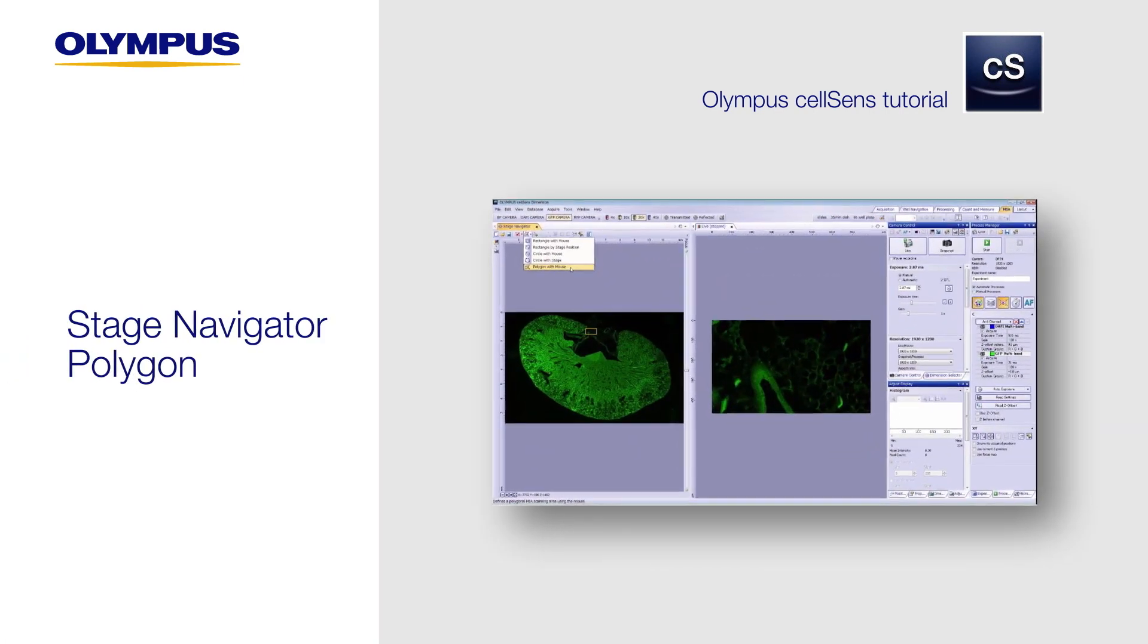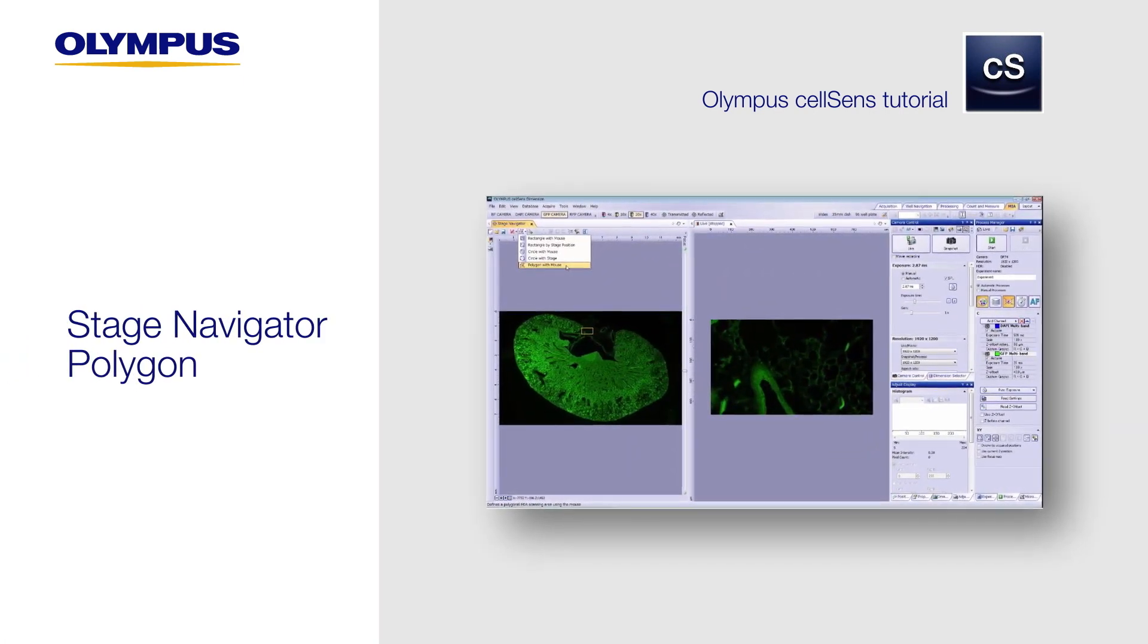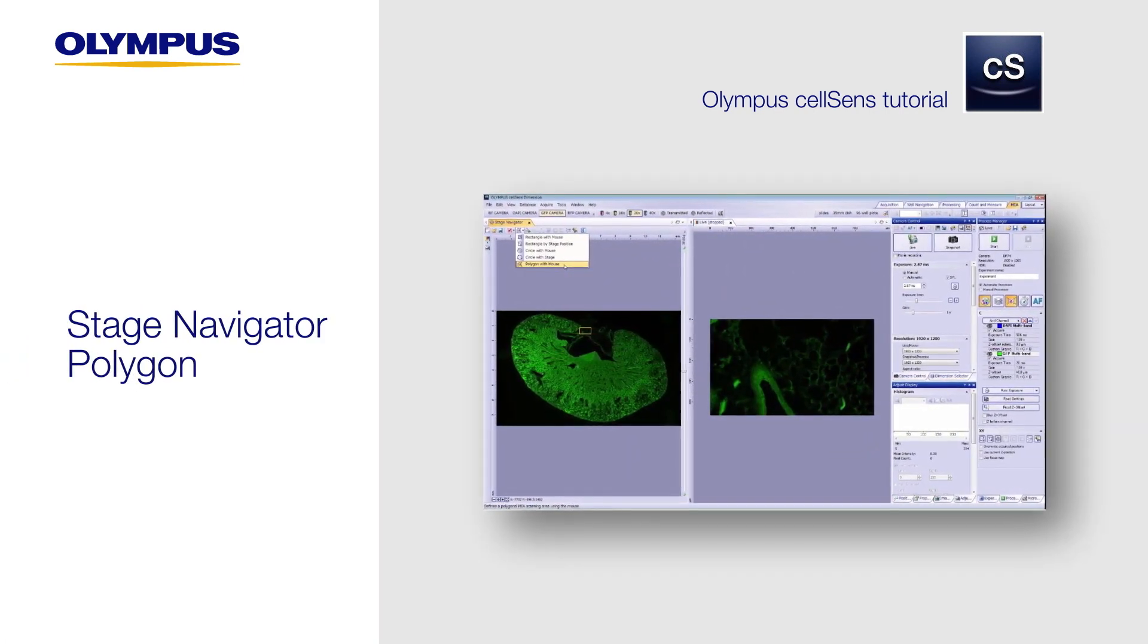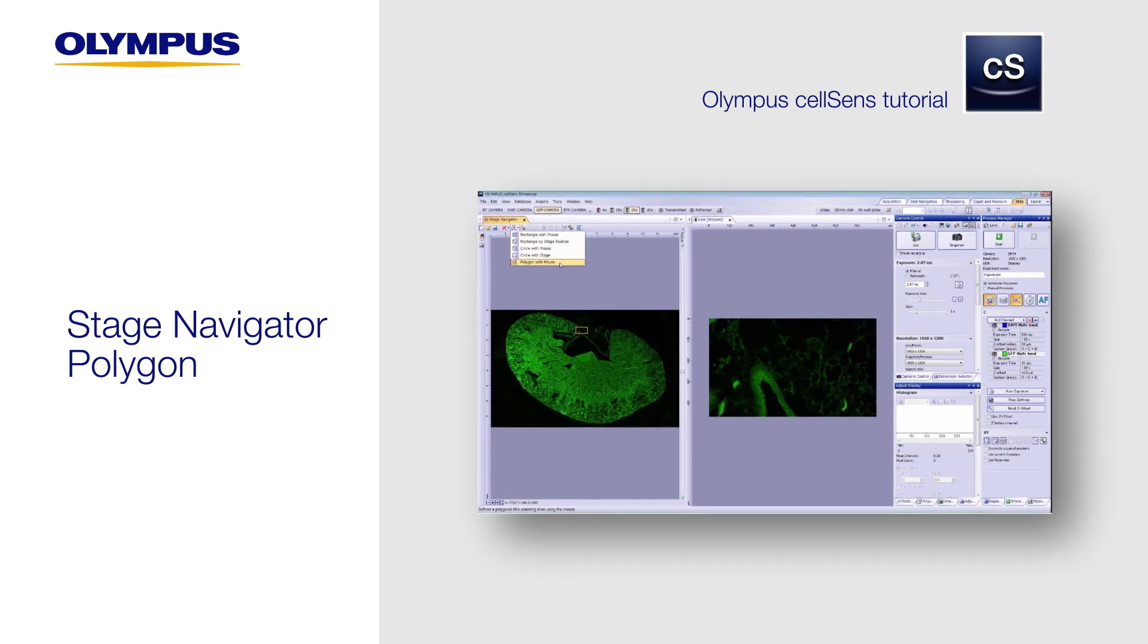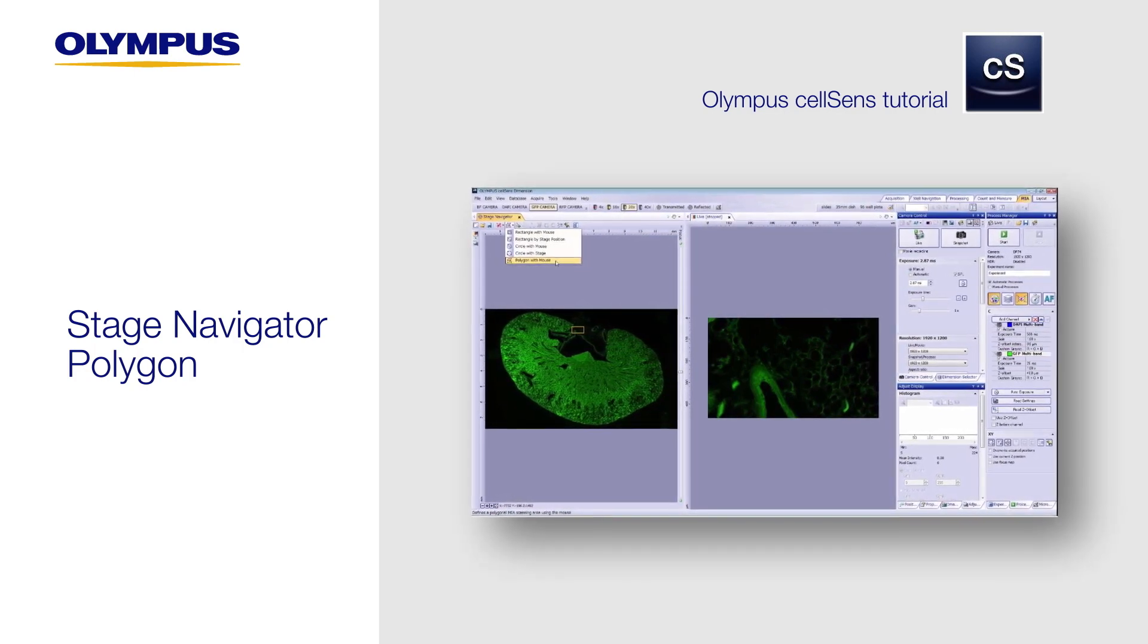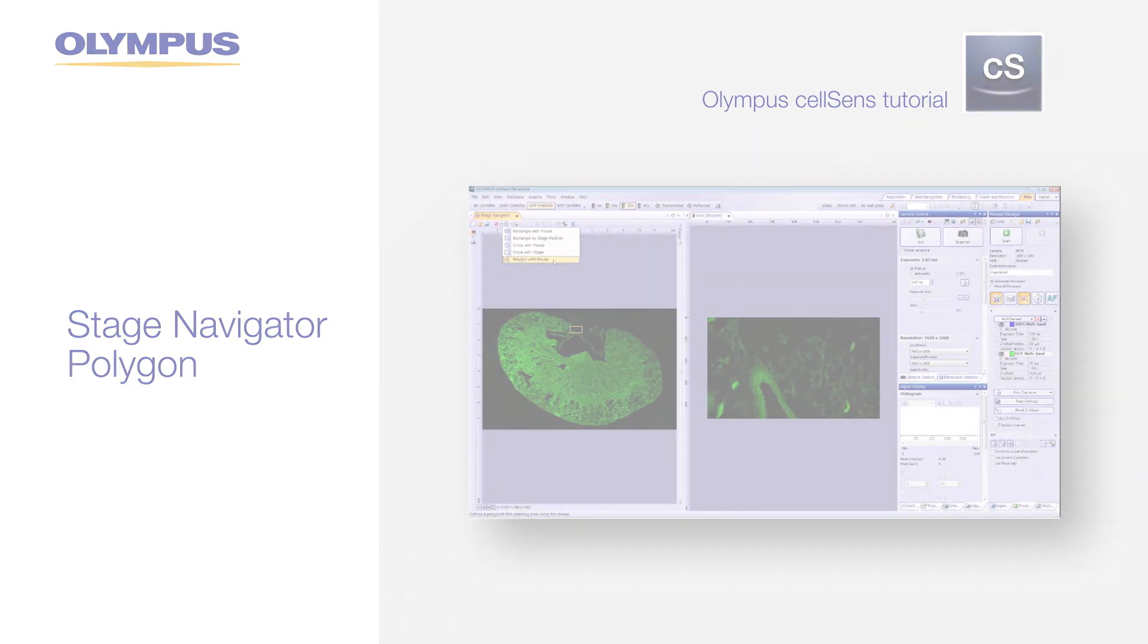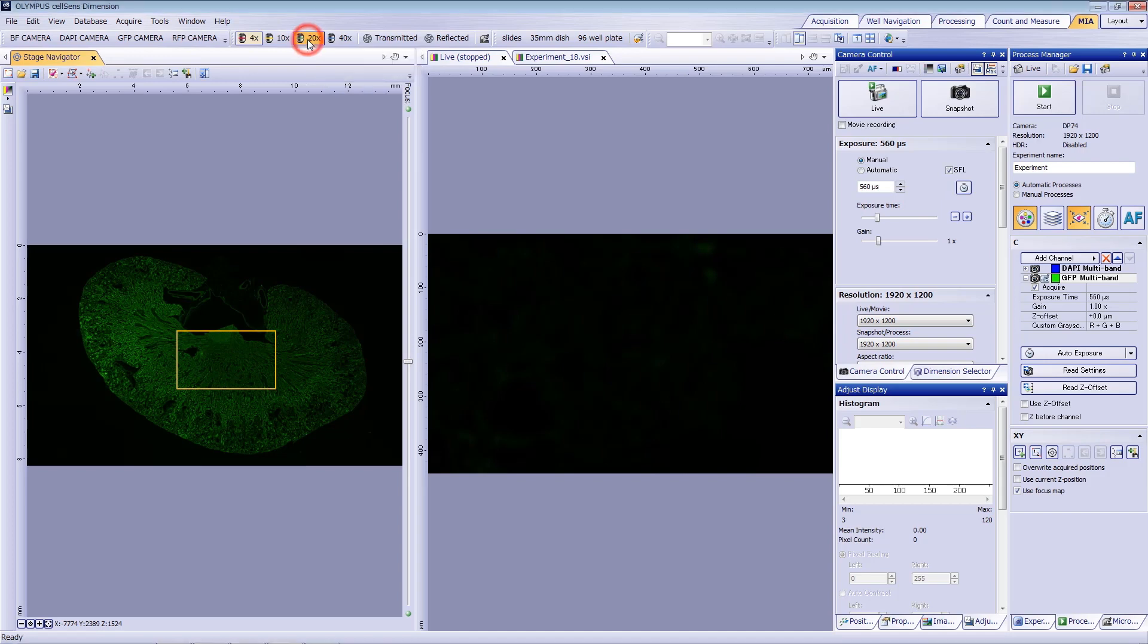The Stage Navigator tool enables you to define a polygon-shaped stitching area rather than a square, helping minimize the number of blank frames and reducing acquisition time. In this video, we'll show you how this function works by acquiring an image of a whole mouse kidney with a 20x objective lens.